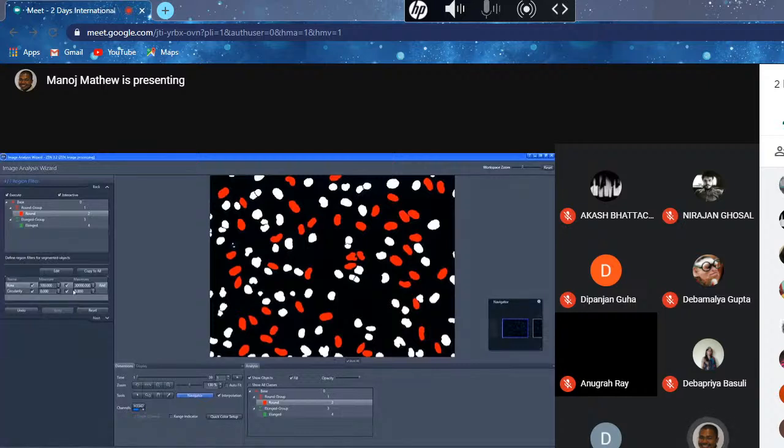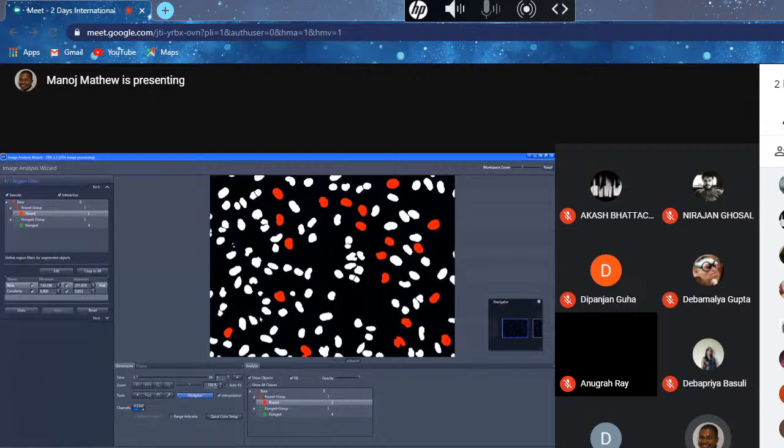Now, in many cases, you don't know this number exactly, right? But you can look at the objects and you say, yeah, these are the objects I want, right? So what I could do is I could reset this, and I'm looking for round objects, and I say, oh, this looks like a round object. So I'm not selecting objects one by one. I'm just updating the criteria here. So every time I select an object, my criteria gets updated. You see, when I clicked here, multiple objects got selected because I'm simply updating the criteria. So I've selected several objects that I thought were round enough, and I'm going to stop at that.